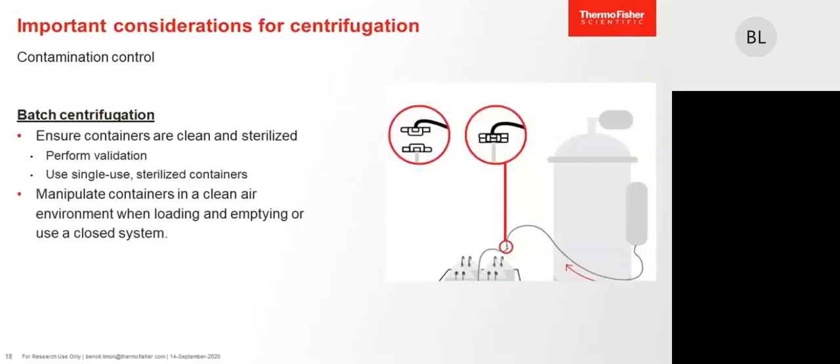In case of the centrifugation, the good practice to avoid contamination is to ensure that the containers are clean and sterilized. Meaning performing some validation, cleaning validation, sterilization validation, to ensure there is no contaminant organism, or to use a single-use sterilized container.